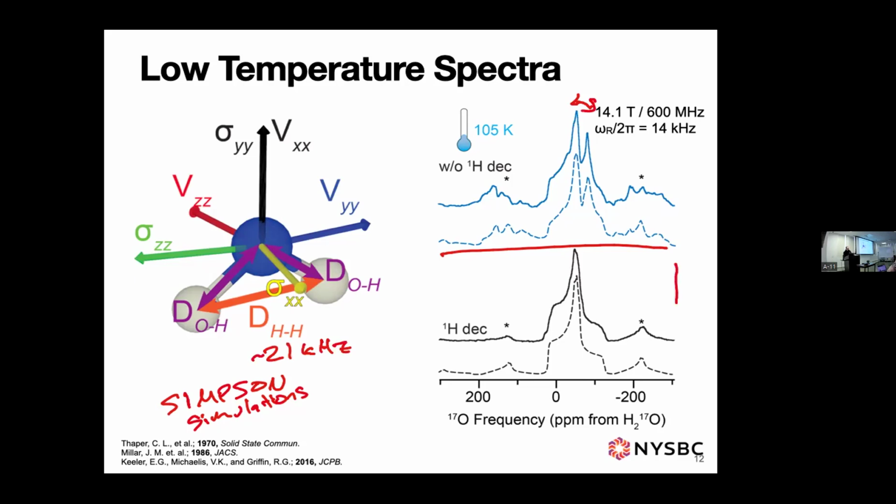But this is what happens when you decouple them. You lose those sidebands or something like that. I mean, the sidebands also have the effects in them too. That's why you get these really weird shapes, and the sidebands, as you can see, don't really fit very well to the experimental sidebands, but it turns out this is incredibly complicated. So we felt pretty good about how well I could fit this.